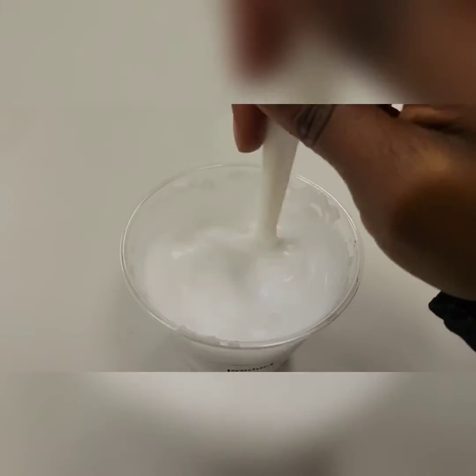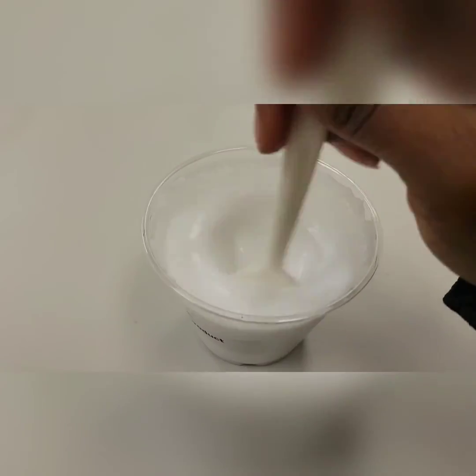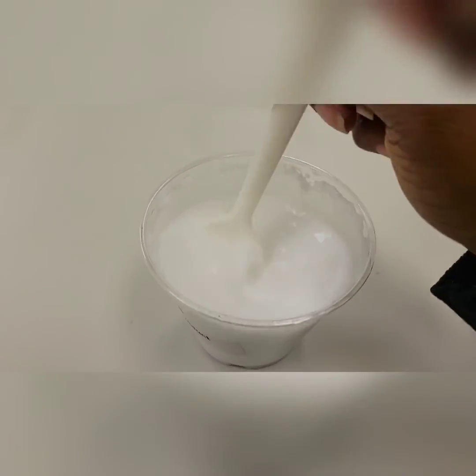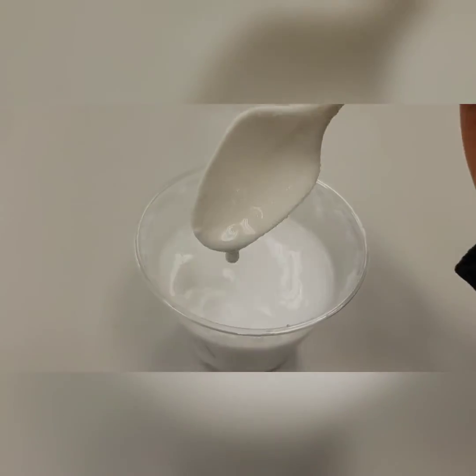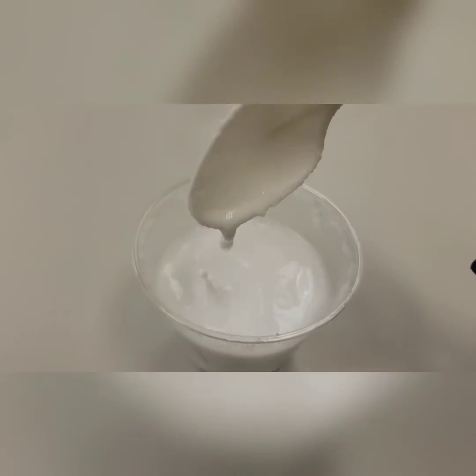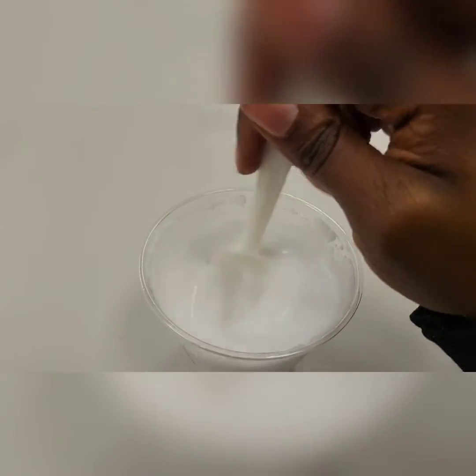So I can even feel the difference as I am mixing. Now my liquid flows a whole lot better than it did before. And you can even see that change in the consistency of the liquid.